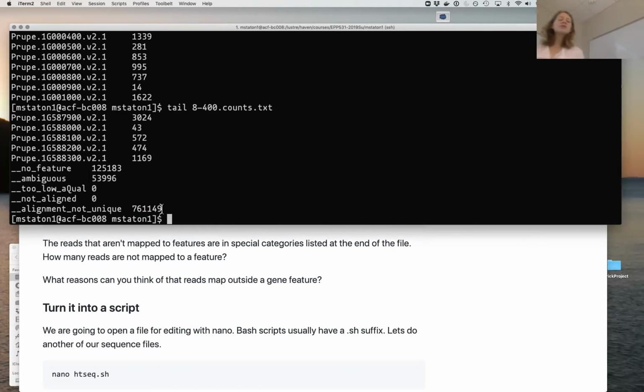The other strategy that we're not showing in this class, but we do all the time in my lab, is you take your raw reads and create a transcriptome assembly. You assemble your transcripts, or you can download your transcripts if there's a reference genome, and then you just map your reads back to the transcripts and count based on the transcripts instead of counting based on the genome. And you can do that, it works fine. The quality of your transcriptome assembly is going to be the biggest driving factor in how accurate your results are.